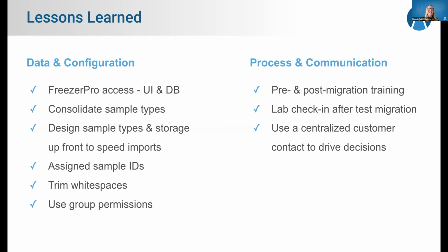The other thing, and these are the nitty gritties, but I was really pleased. We decided to generate the sample IDs within our custom scripts rather than letting Sample Manager generate those IDs upon import. And that actually allowed us to iterate much more easily on adjustment of fields or updates because we had that sample ID rather than having to go into Sample Manager, extract that sample ID, and then perform the update.